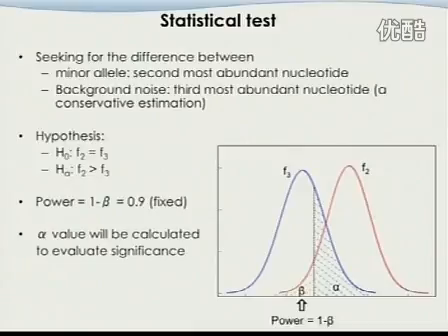Because we are still on the diploid genome, our hypothesis testing falls into this. For the alternative, the second largest number is significantly higher than the third largest, which represents the noise. Then we will be able to calculate the p-value. You can imagine there's a peak representing the sequencing error, a peak representing the alternative allele, and how well they distinguish each other.